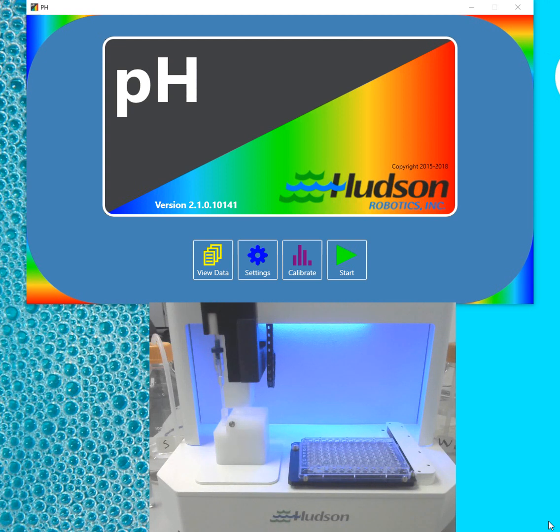Hi, this is Tom Copeland with Hudson Robotics. Today I'm going to be showing the calibration function of the Rapid pH.